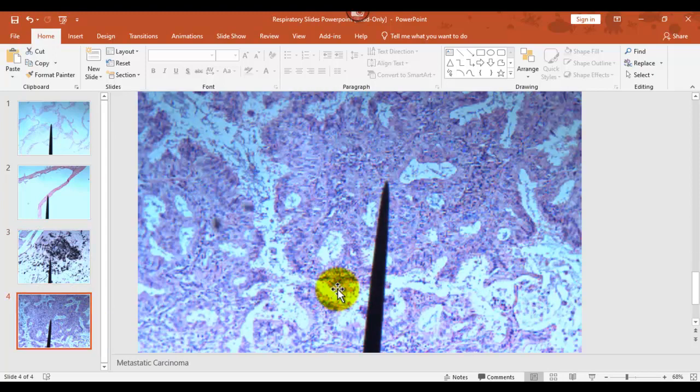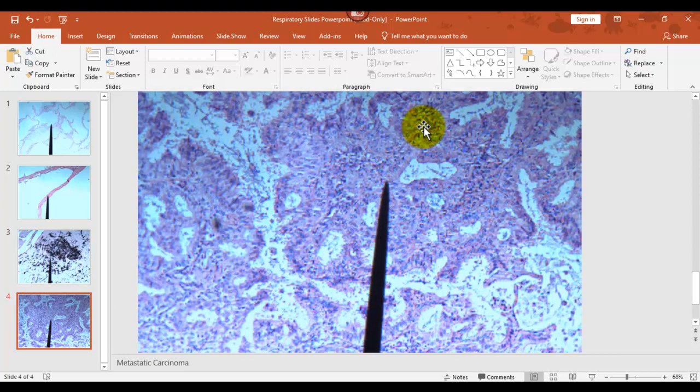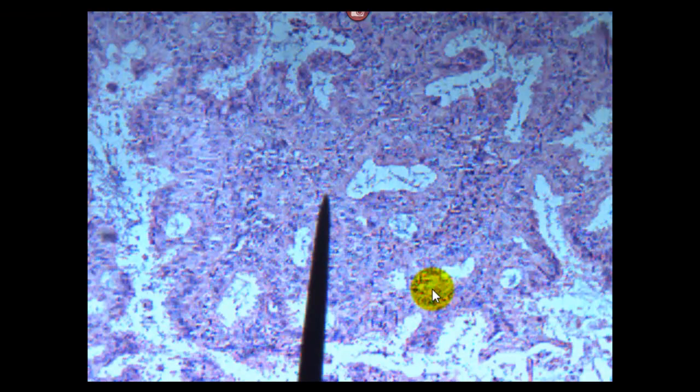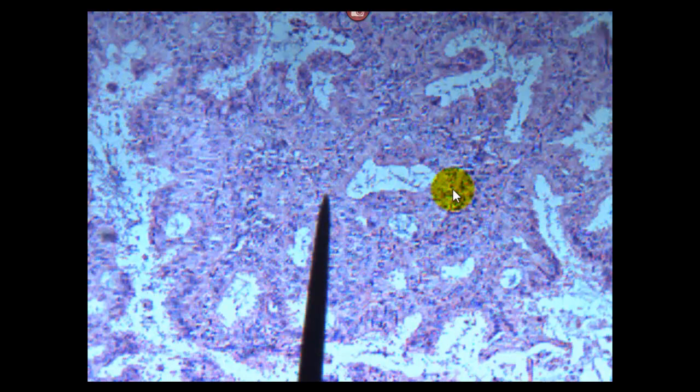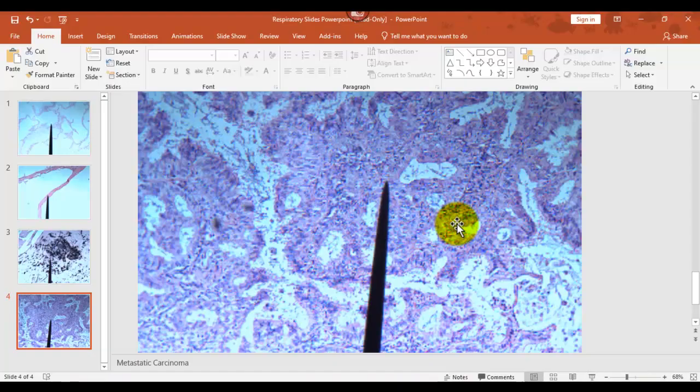Last slide. This is a tumor. See all of these? This is all cells. If you get really close, if I blow this up, you can see the nuclei of these cells. These are all squamous cells. You can kind of see where there's still some space in the alveoli left here, but yeah, it's all filling in.